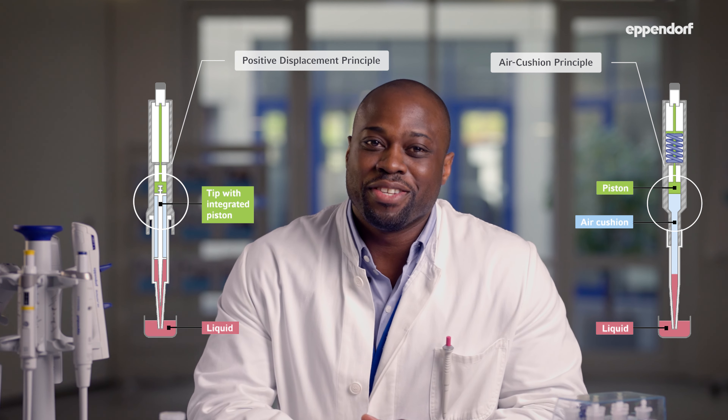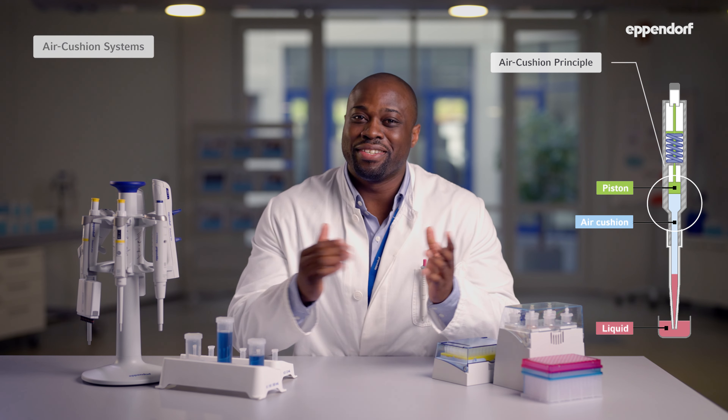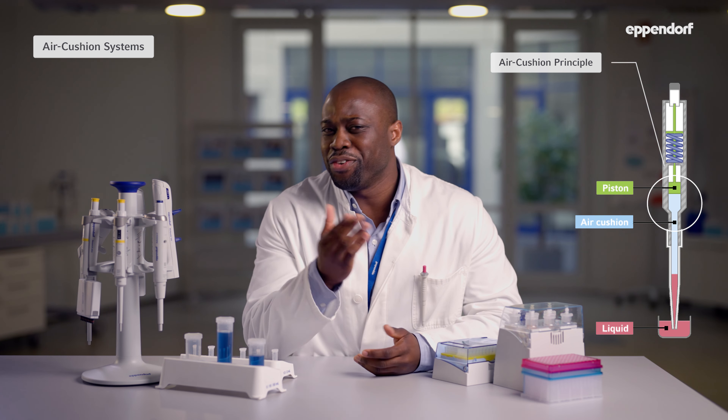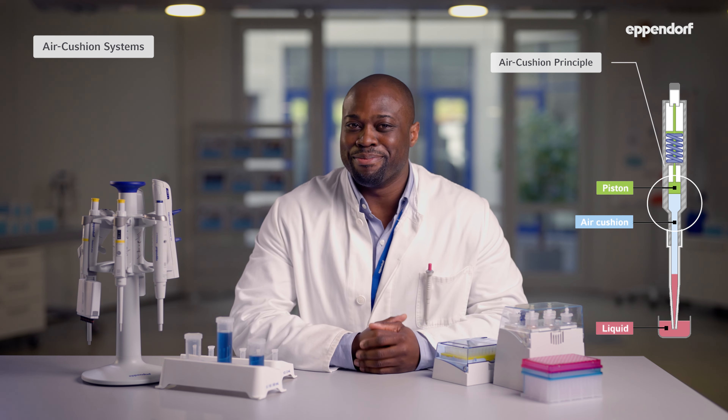Pipettes are engineered on the basis of two major operating systems: air cushion systems and positive displacement systems. These two systems have very different internal components. Air cushion systems are the most common type in labs around the world, so if you don't know which type of system you have housed in your pipette, it's probably an air cushion system.